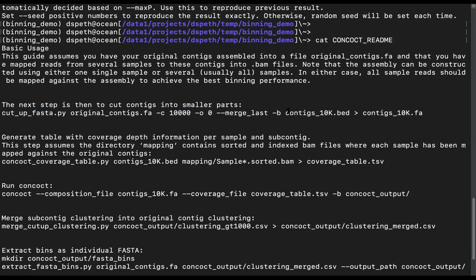And this one will immediately give you a bed file. The bed file is a thing that is borrowed from eukaryotic genomes, and it can tell you where a subsequence sits on a larger sequence.